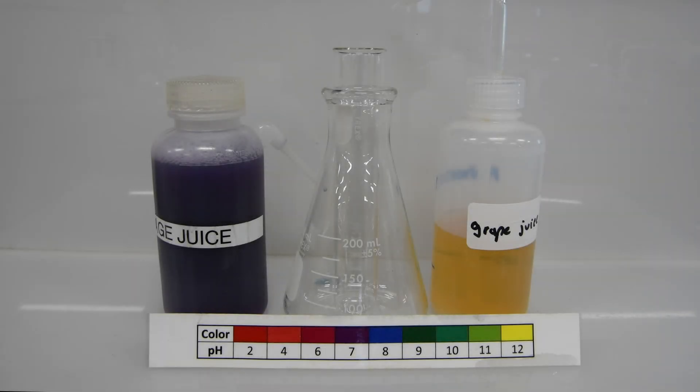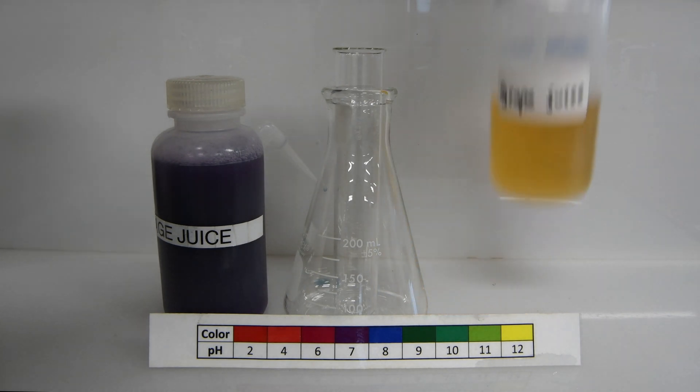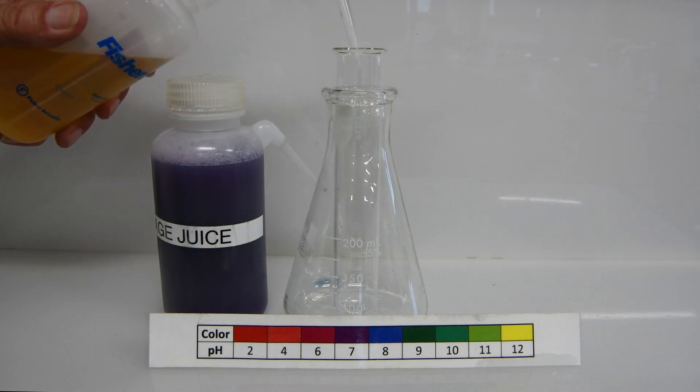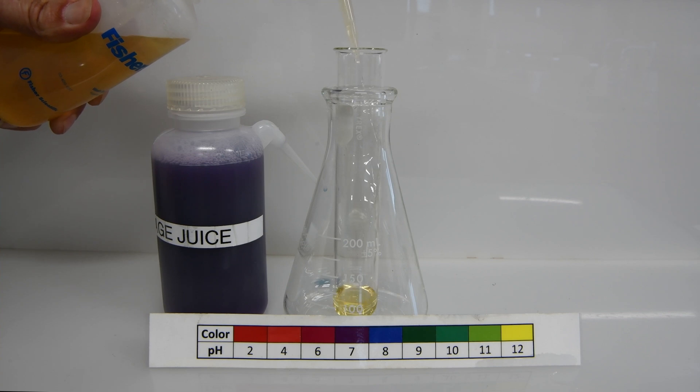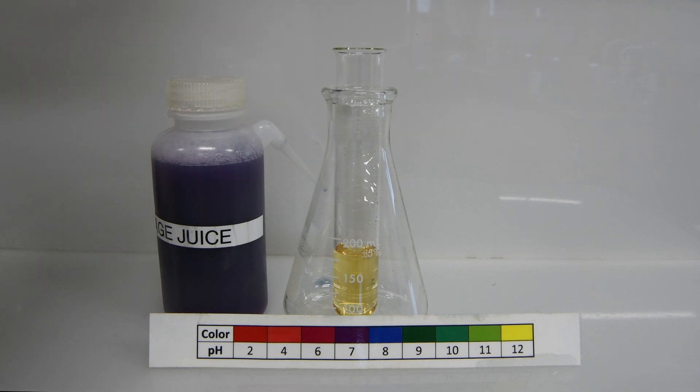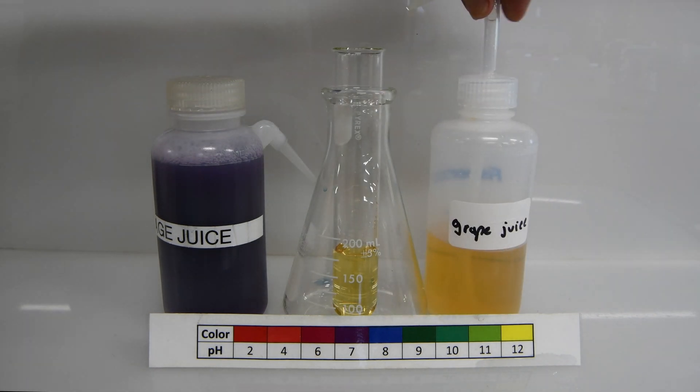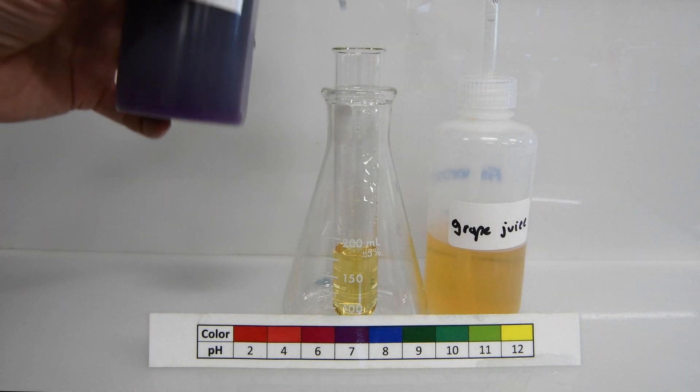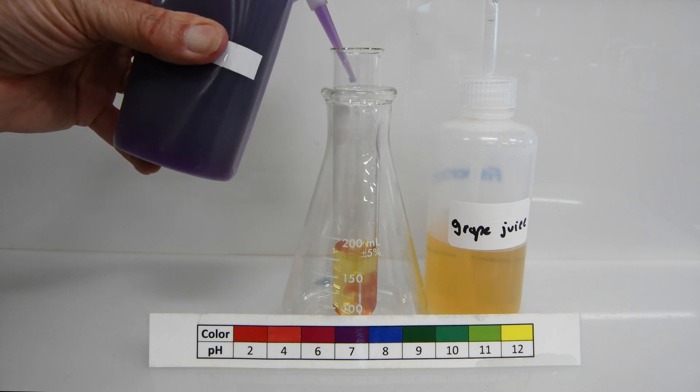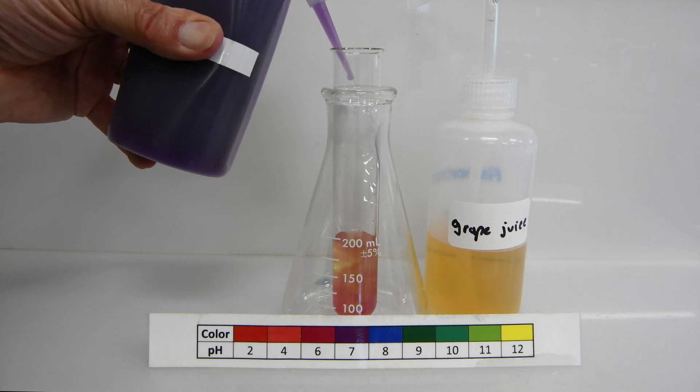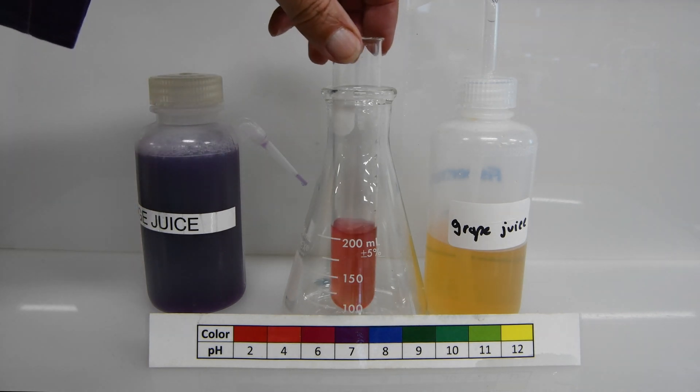Next up, we'll be testing grape juice. You'll notice we're using white grape juice because the purple juice, of course, would be too difficult to see the color change. That pale yellow or amber color will not cause us any problems. Now our requisite squirt of cabbage juice. And we have a reddish color.